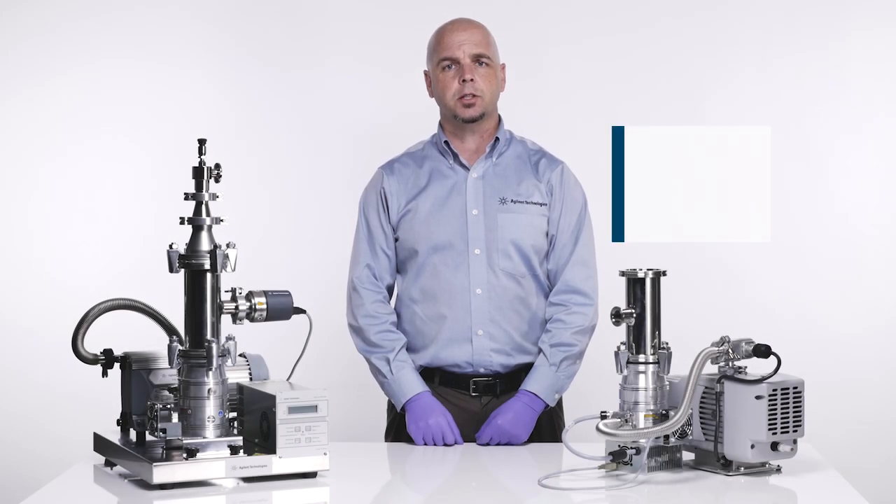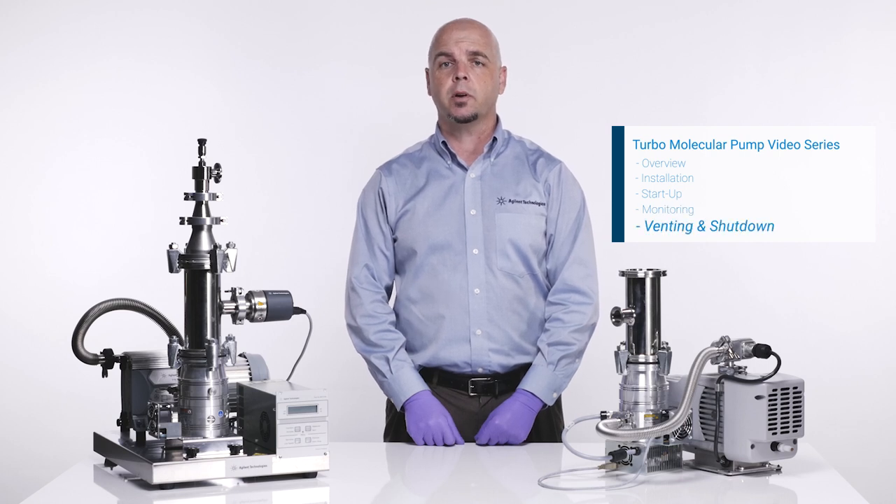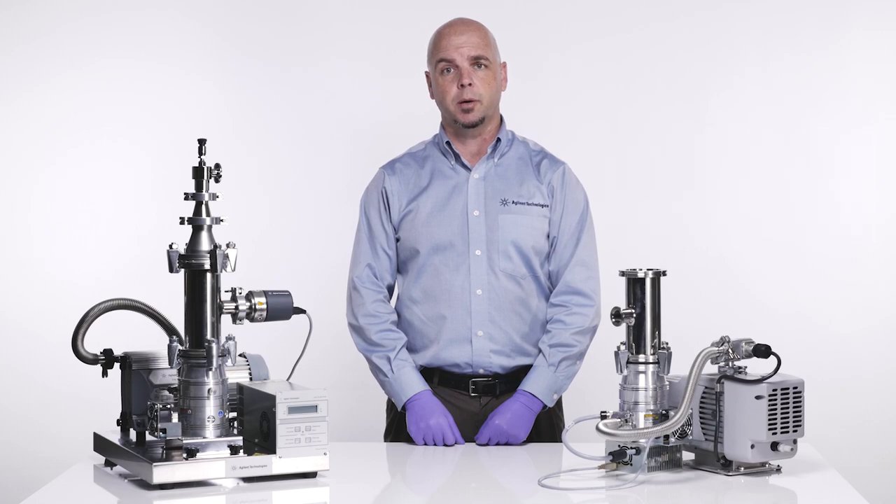Welcome back to Agilent Technologies video series on care and use of turbo molecular pumps. In this video we are going to cover the proper venting and shutdown of a turbo molecular pump.